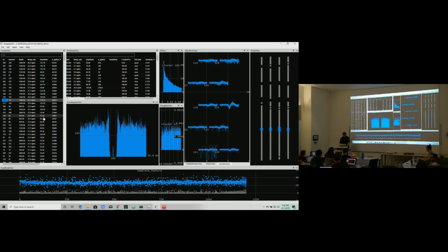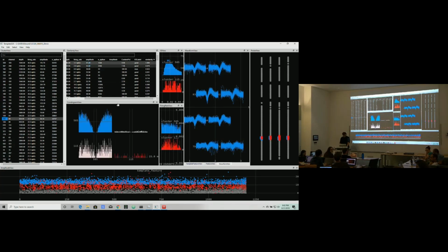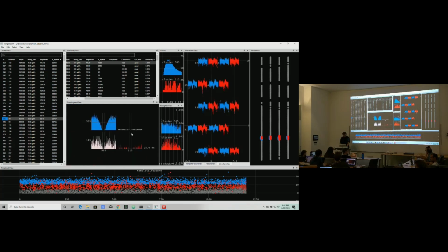Let's see if we find any example of that. So ks2 1 had the post hoc merge. Does this automatically do that already? That version, that is happening throughout the optimization, because that was really good for getting rid of really big noise. And so with the moving stuff, there's always noise, right? It was really good at getting rid of those, and then with all the neurons, it's easy to split those apart. You might be the first person that has success with that.